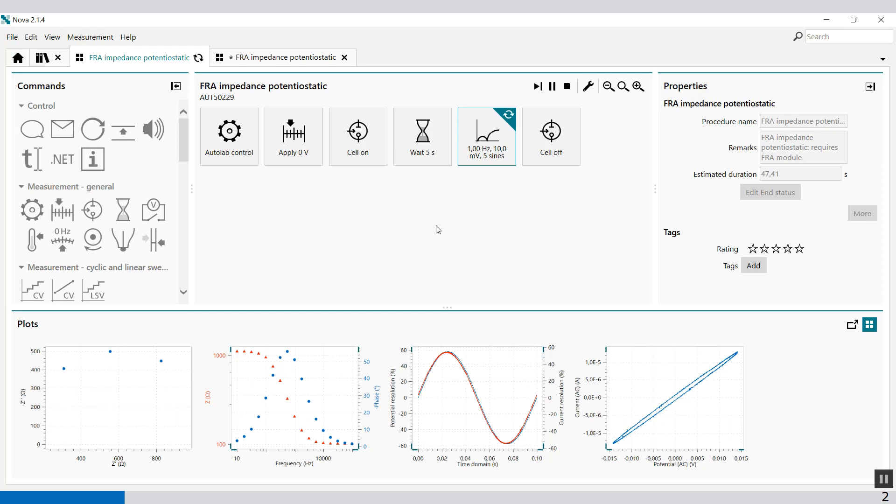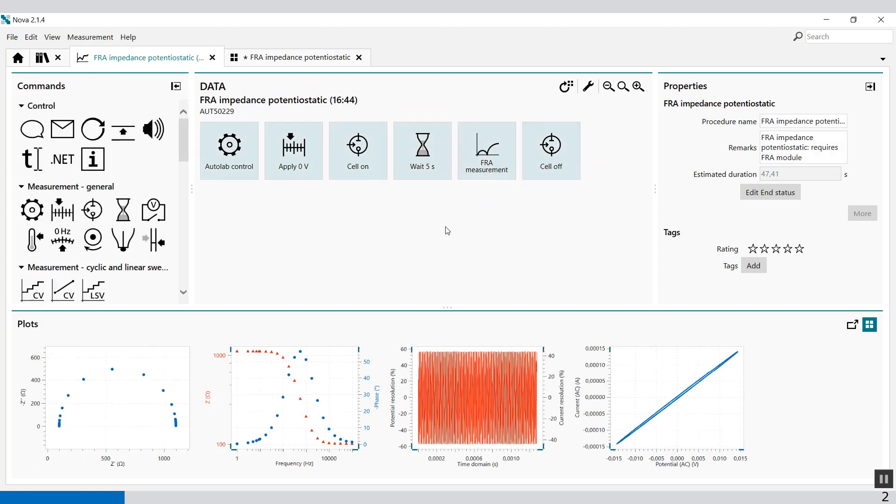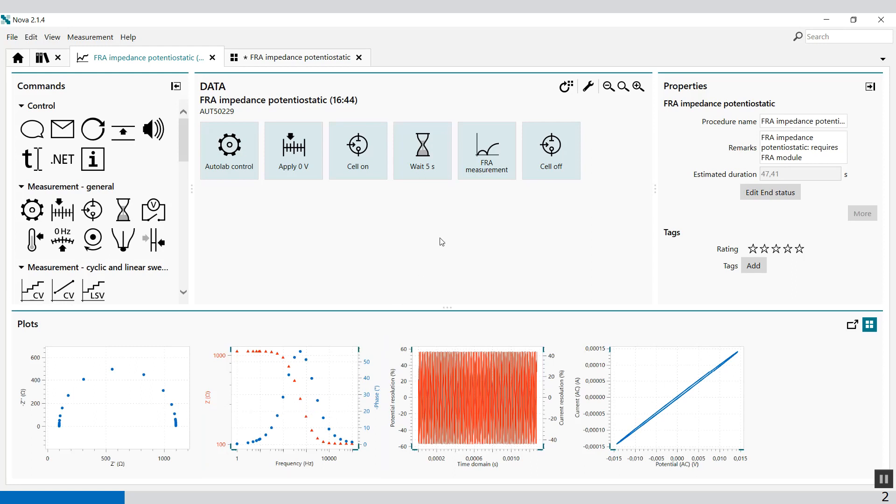Now we're at the last frequencies with five sines. And here we go. This is my measurement of the impedance.